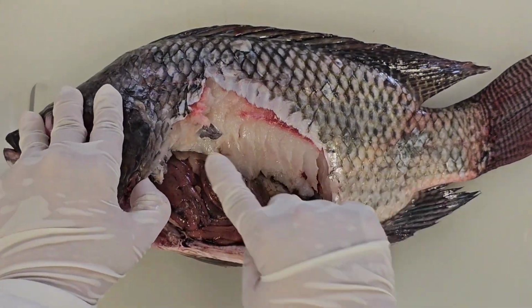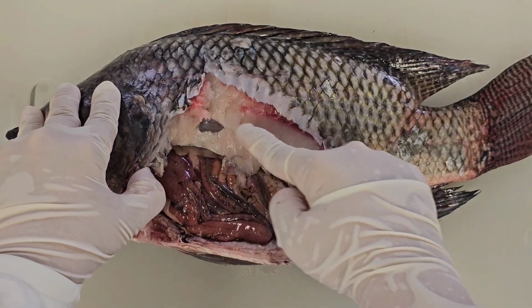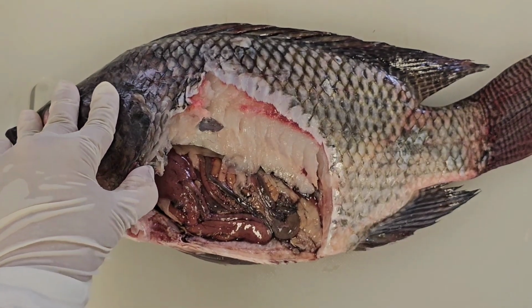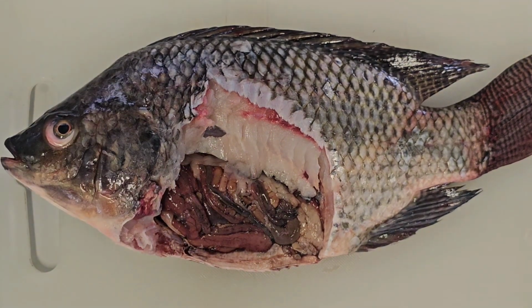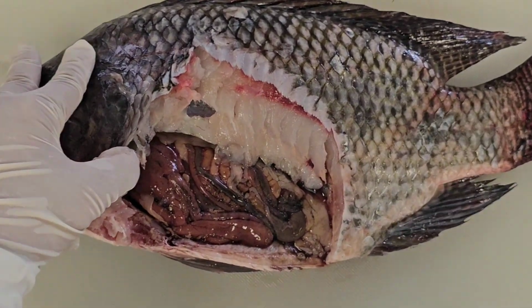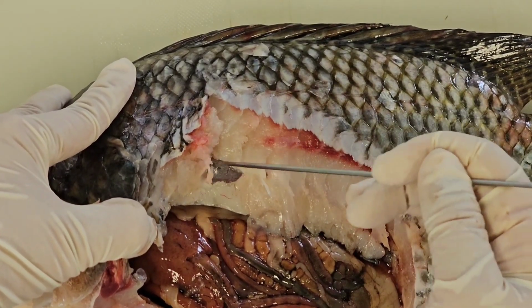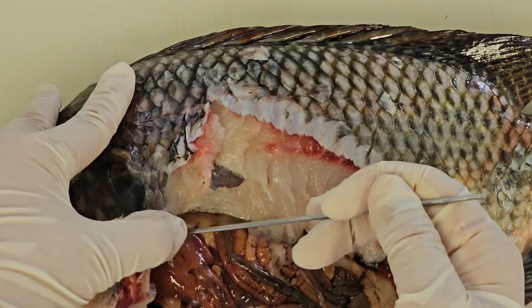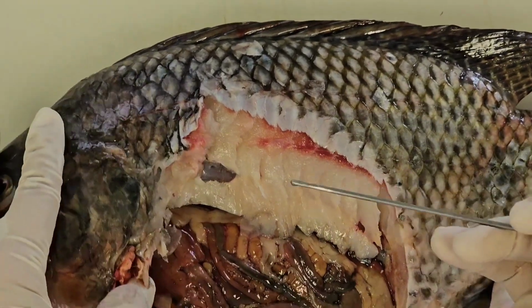If you look at the dorsal part of the abdominal cavity, you can see a hole inside. In this hole is the swim bladder, which contains air and helps the fish float in the water. So I will zoom in so you can see the membrane here. This one is the membrane of the swim bladder. Normally this part in Thai we call กระเพาะปลา. So this one is not the stomach, it is the swim bladder.